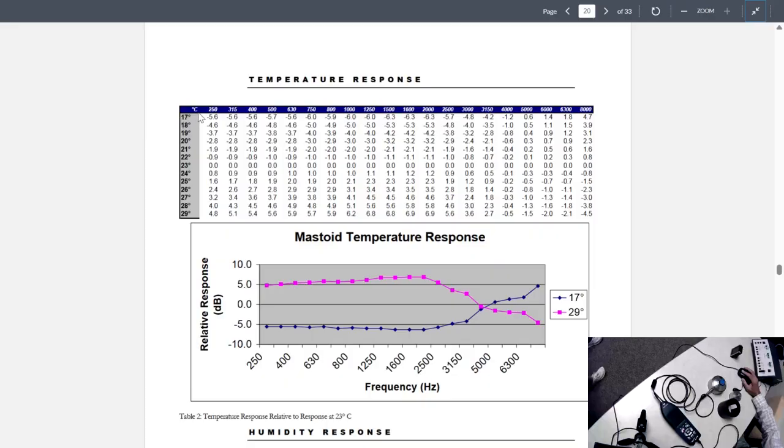Oh no, it's in Celsius. See that? This is Fahrenheit. Oh no, what do I do? Conversion. So the easiest way is to push the button on the back, and now it's in Celsius. Okay. All right. So it reached 24. Is it? Okay, 24 degrees.